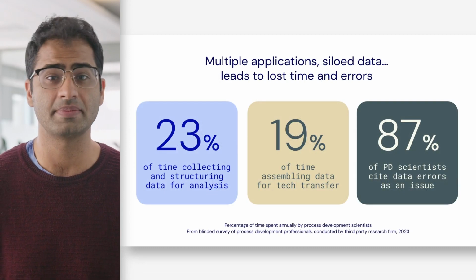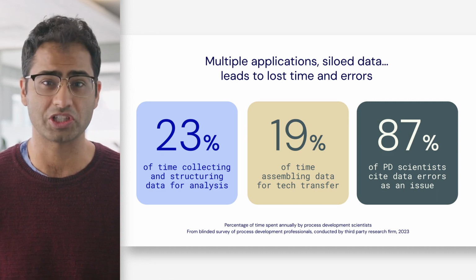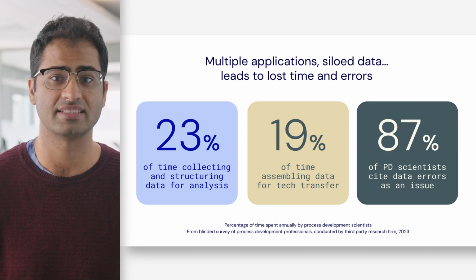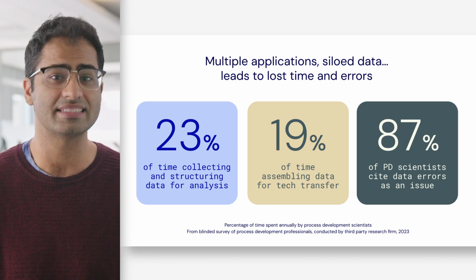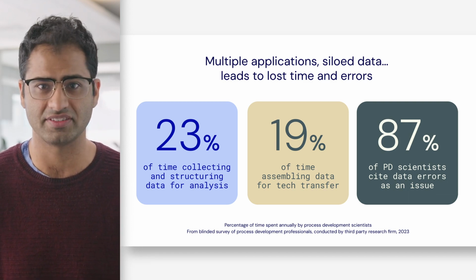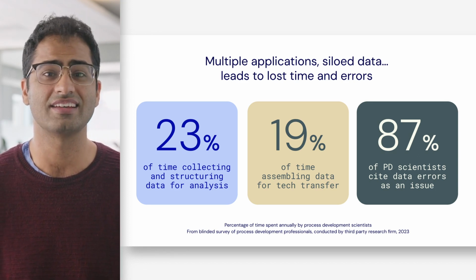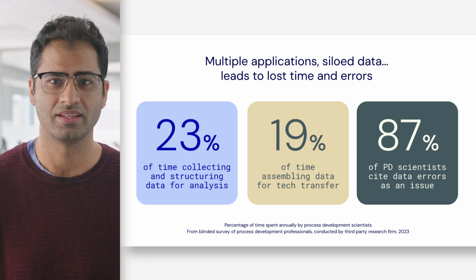The first is about 23% of their time is spent collecting and structuring data to be used for analysis. The second is that 19% of their time is spent assembling data for tech transfer. And the third is that 87% of scientists cite data errors as a concern.